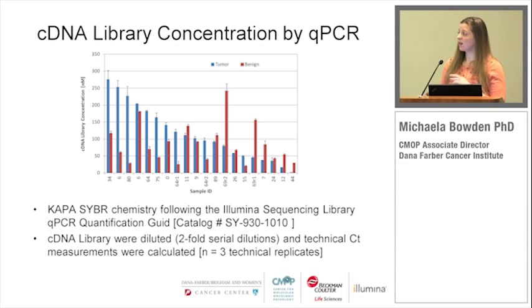And you can see that even when you look at the tumor region relative to the benign region, you actually get differences. So even within a block where you're taking tissue from the same patient's specimen at 2 different locations, how cell-rich that area is also has an impact on whether it degrades quicker or not. And that's something we really don't understand. It's something that we're trying to bioinformatically understand from the sequencing data, but we don't know why that is.